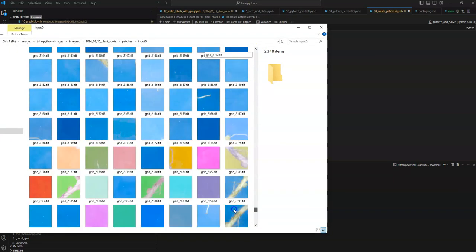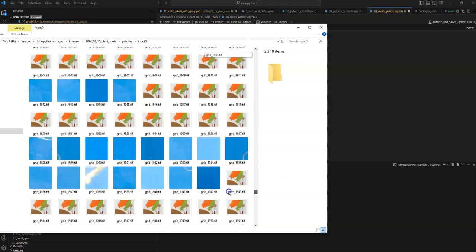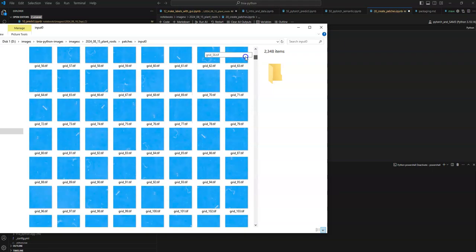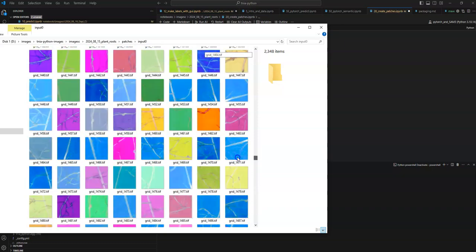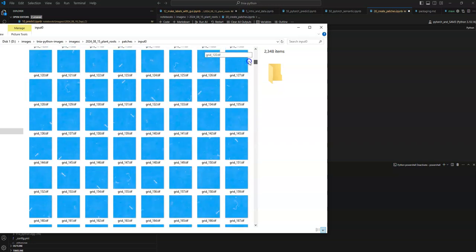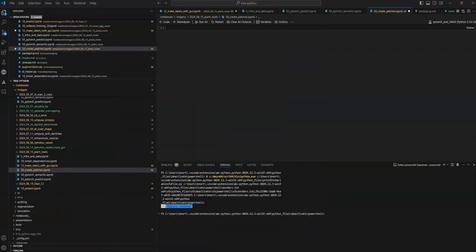And I think this might be a little overkill actually, we've got almost 2,500 patches, some of them quite colorful, most of them not colorful because color isn't a big deal for this problem, as far as I can see. But just to make the network a little more robust, we did do some color ones. Mostly rotation, reflection, intensity based transformations. Okay, so now that we have artificially created a lot of data.